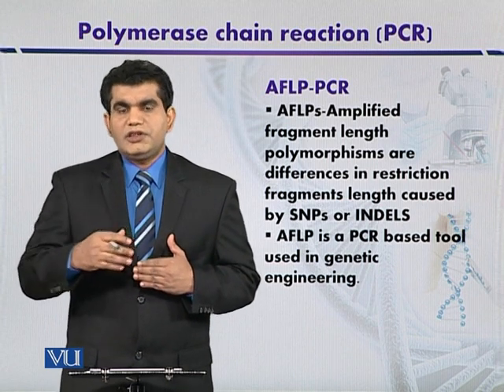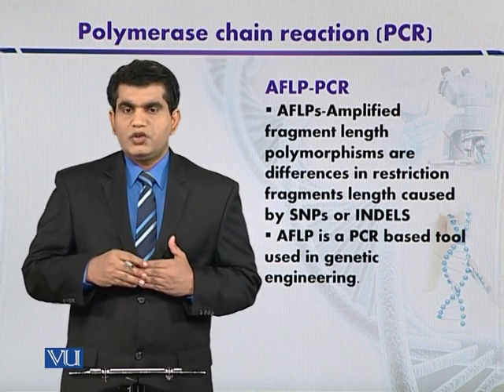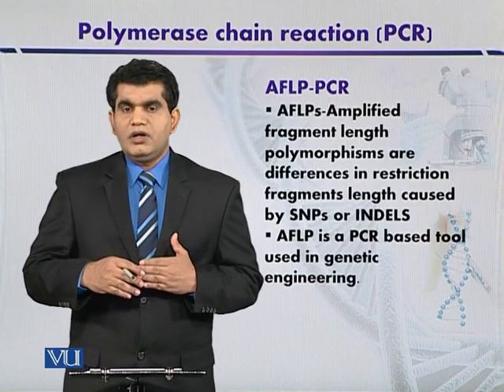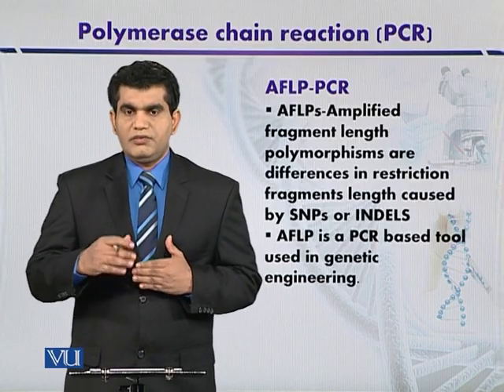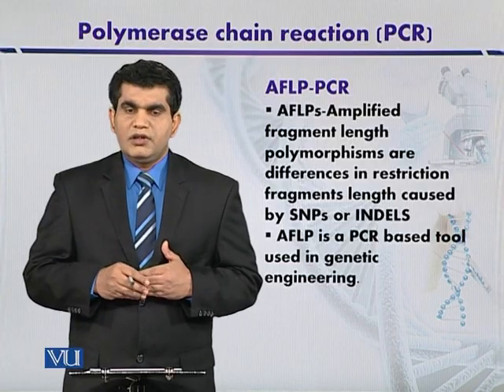So this technique can also be used to find the variations within the DNA sequence or the polymorphic DNA.